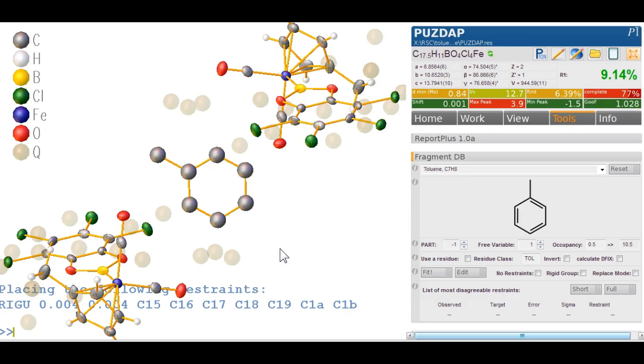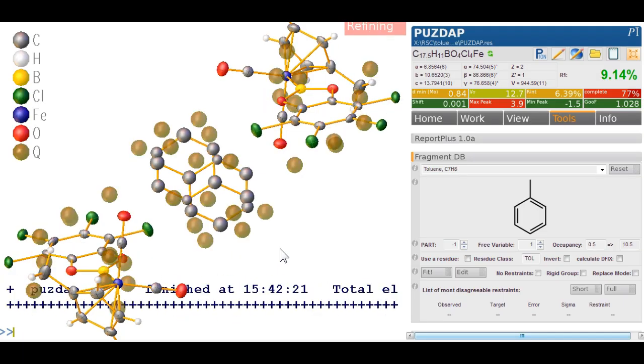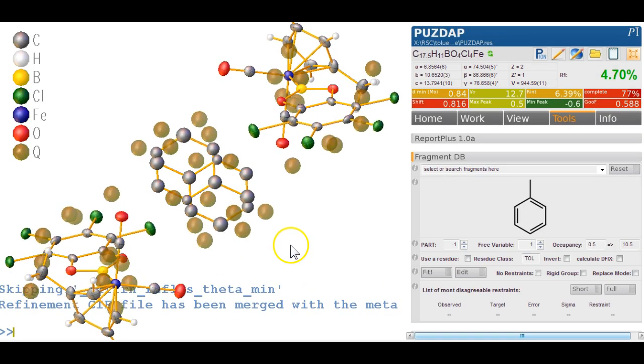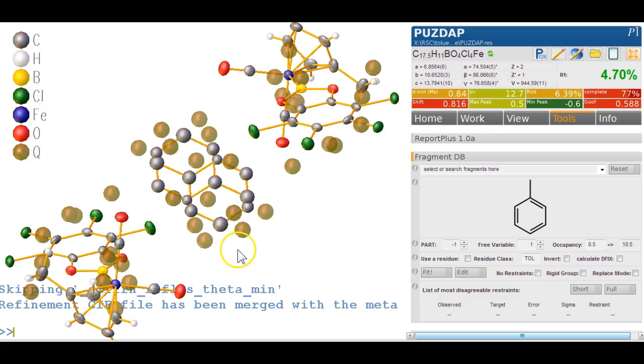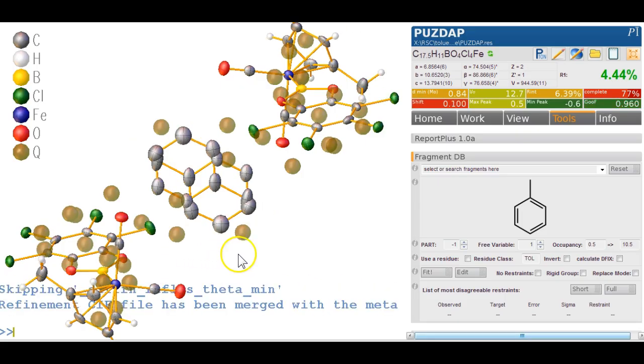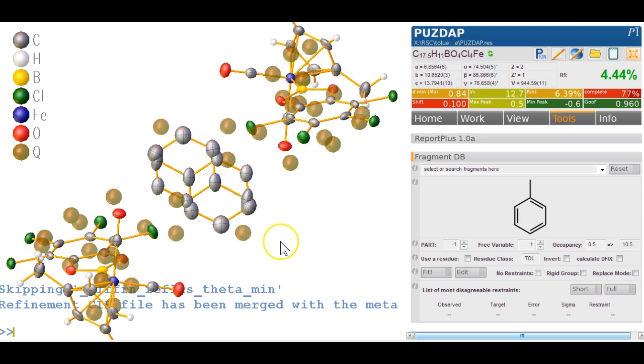This step is a little bit fiddly and needs a bit of practice, but it's not very hard once you know what you're doing. So let's refine this just as it is, control R and we can see how the full disordered part is visible on the screen. We go Arnis and type control R again to make it all anisotropic.